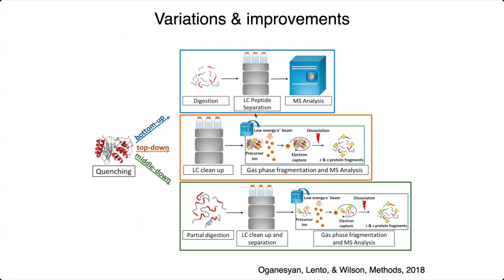There are also various other things you can do to improve the resolution, the telling apart of the different fragments, things like that. So there's a really great review article I will direct you to.